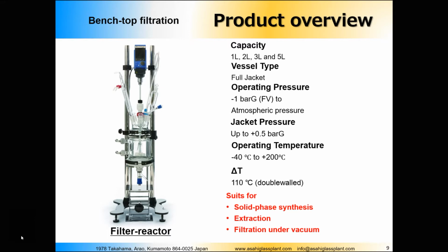So solid phase synthesis was used for this kind of synthesis for quite a long time, and this is how it is done. There is a so-called solid phase, which is usually a polymer, for example something like polystyrene.